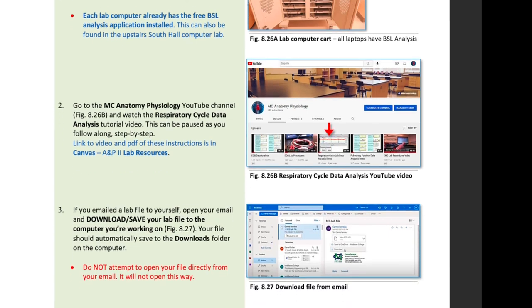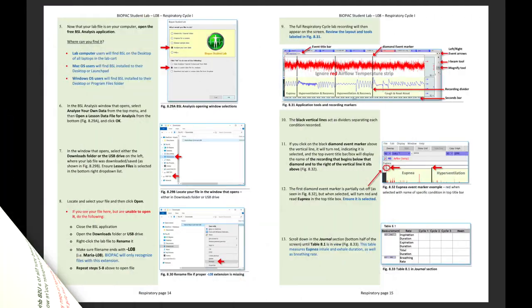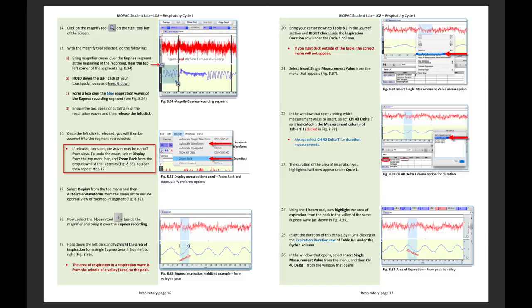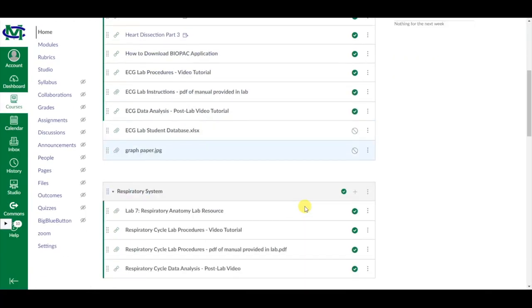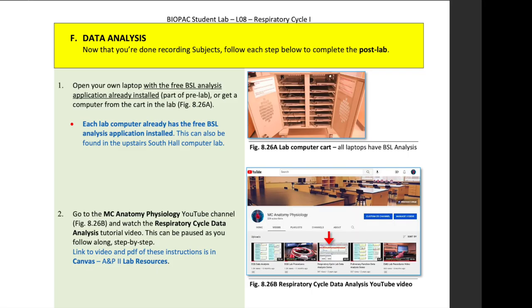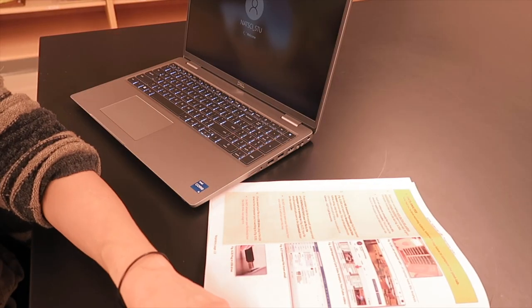This video follows the data analysis section of the respiratory cycle lab procedures provided in lab. A PDF of these instructions can also be found in Canvas A&P II lab resources. The first step in the data analysis portion of the instructions asks that you get a computer with the free BSL application already installed. This is the same software that was downloaded as part of the pre-lab.